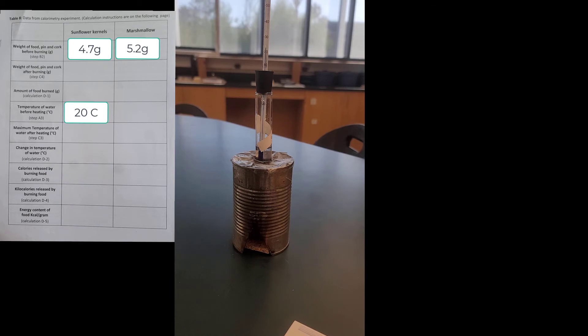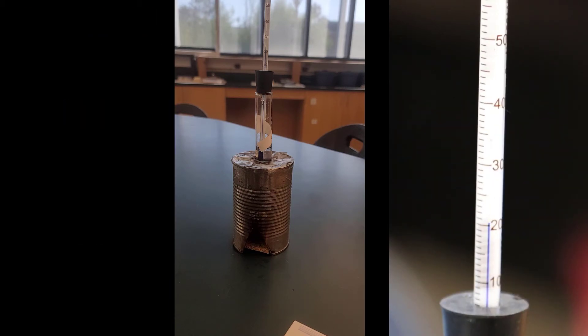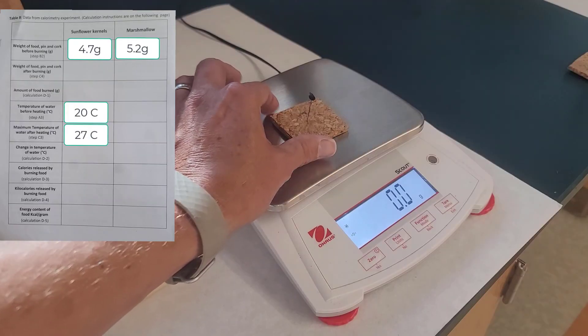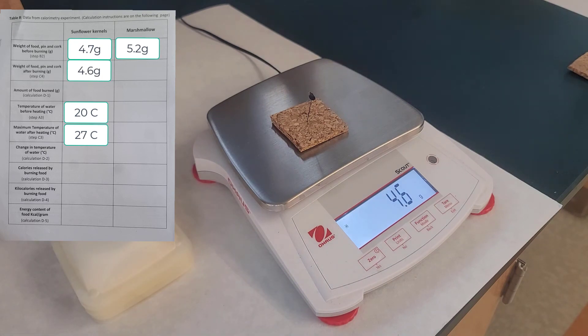By the end of this experiment, we now have how high the temperature went. We had our starting temperature and we have our temperature at the end of the experiment. Now what we do is go weigh the sunflower seed and see if it weighs less because we burned some of it. The difference between what we started with and what we ended with is how much we actually burnt.